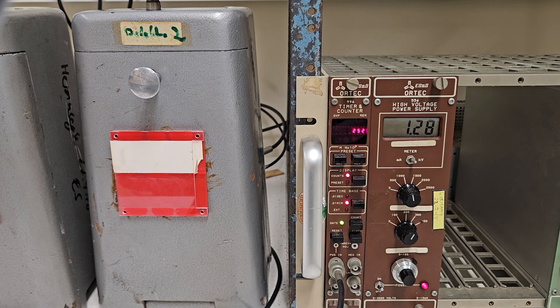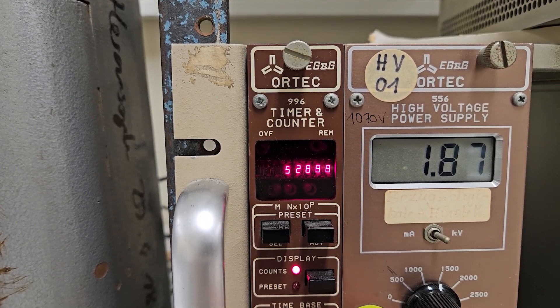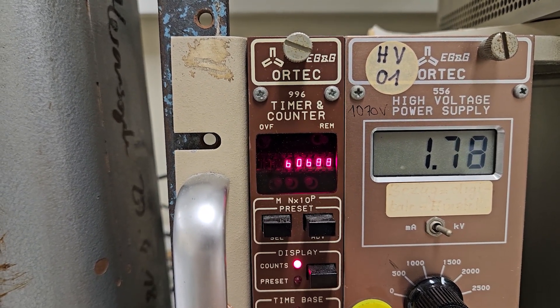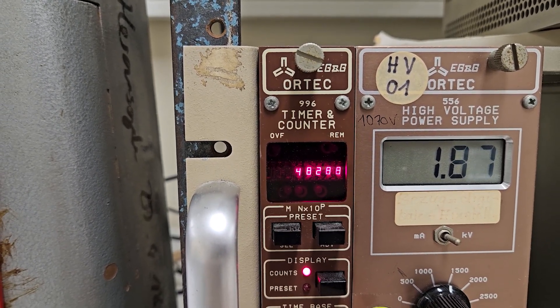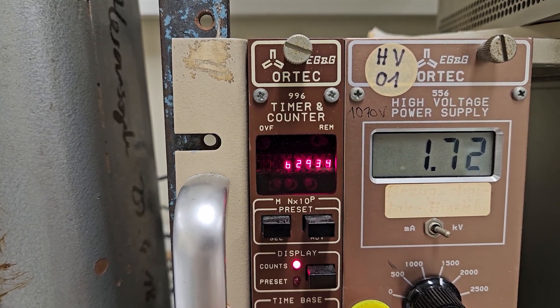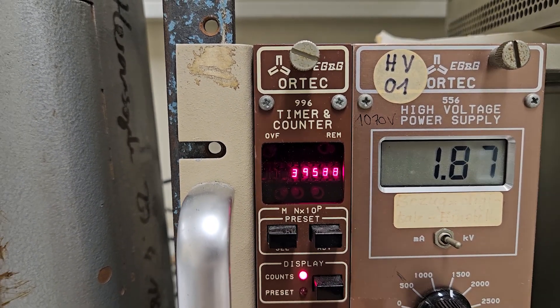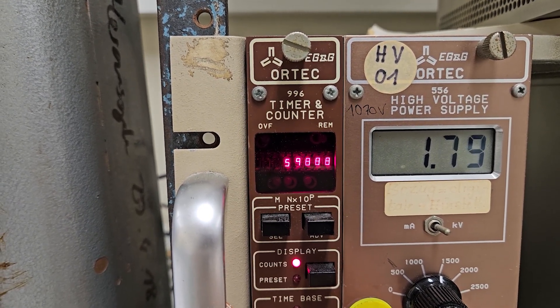If you forget this and keep going, you might hear something like this. Ideally, the assisting person should have said something 10 minutes before, but in this voltage range you definitely damage the several-hundred-euro expensive Geiger tube. You just hear the electricity frequency.